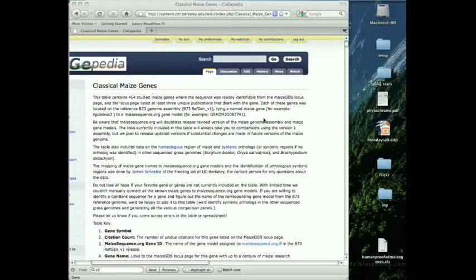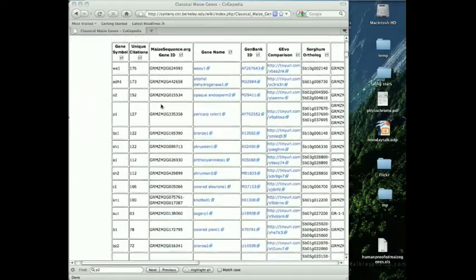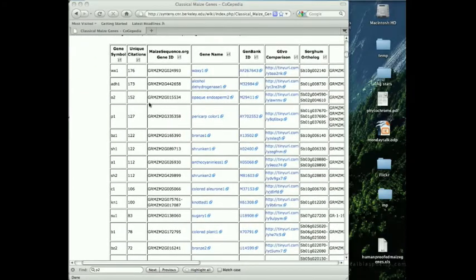Hello, my name is James Schnabel, and today I'm going to be talking about how to use GEvo for people who don't have previous experience with it. GEvo is part of the CoGe toolkit, and I'm making this video because of a new resource we've just made available showing classical maize genes and equivalent models in the reference sequence of the maize genome that was released by maizesequence.org.